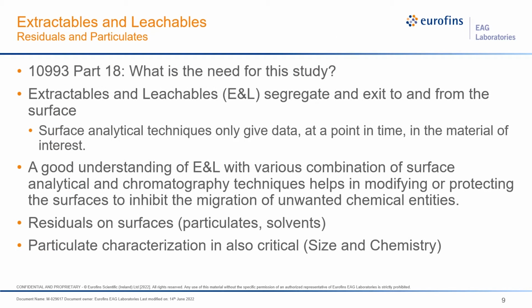Extractables and leachables, surface residuals, and particulates are integral part of Part 18 testing work. Body fluids interact with the devices and extract material that may have toxicological effects. These segregate and exit to and from the surface.